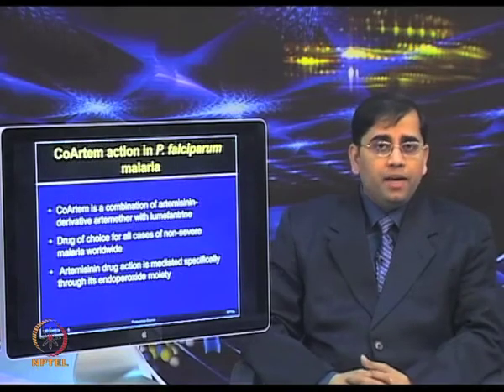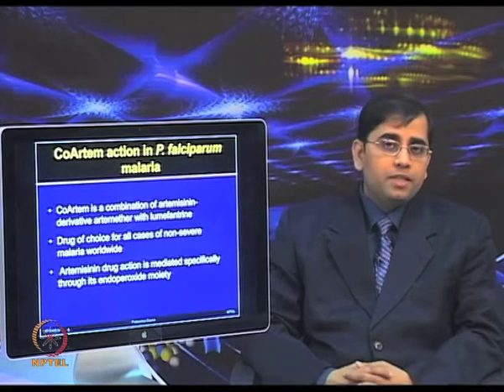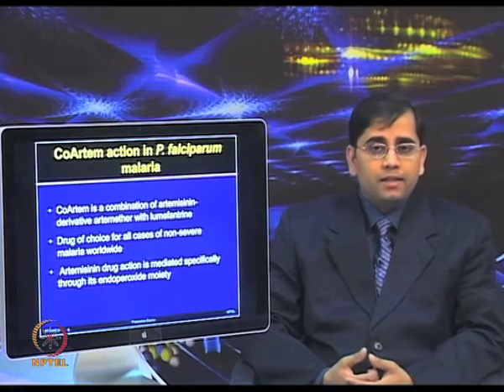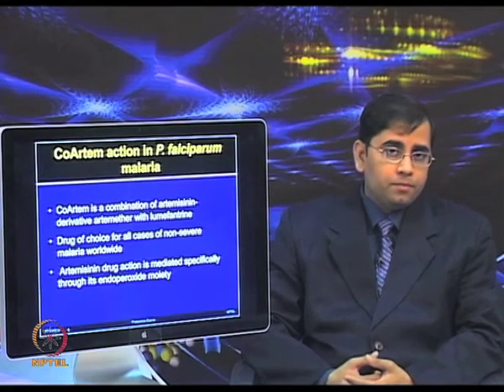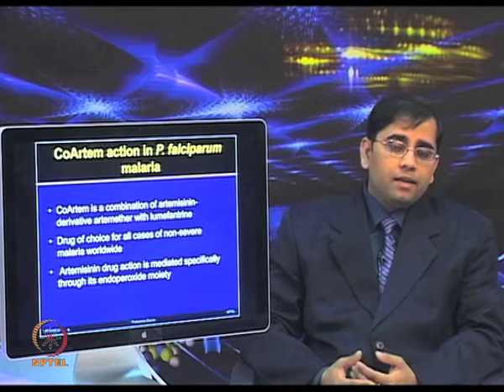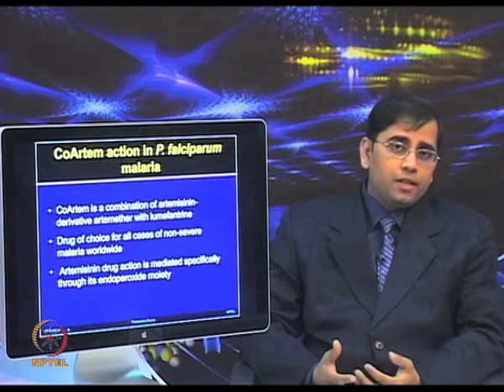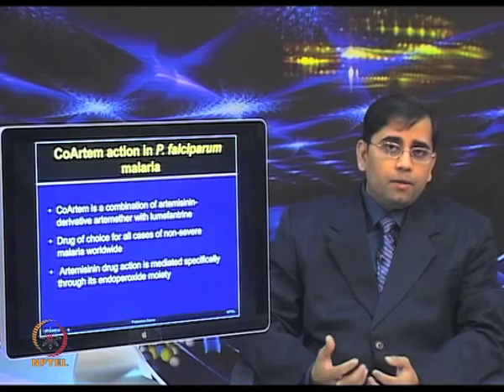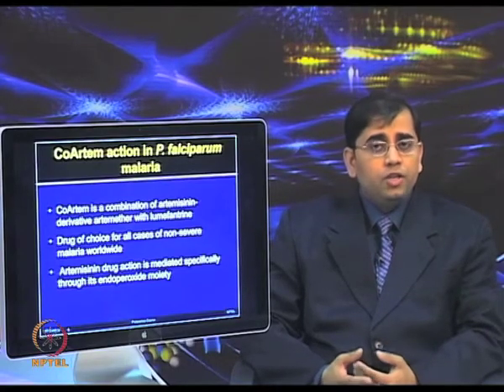How these two drugs behave and how proteome changes occur due to their action was studied in this paper. The authors applied a proteomic approach, two-dimensional electrophoresis, to study the proteomic alteration of each of these drugs.